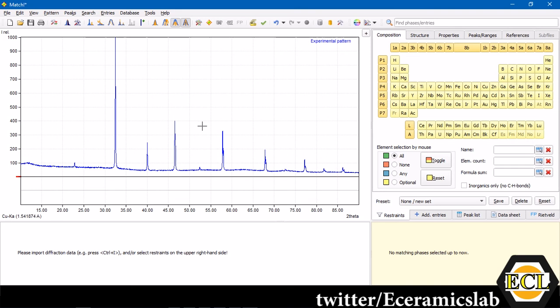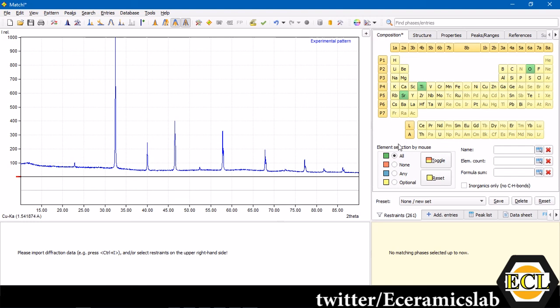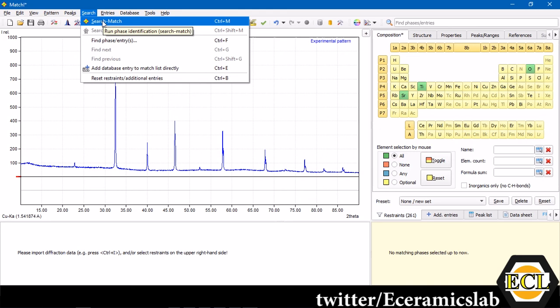We know that our sample has strontium, titanium, and oxygen. We'll move down to this periodic table where I can select the elements which I know are possible in my sample. I'll select the strontium, titanium and oxygen. Then I'll go over to Search and you can click over Search Match.